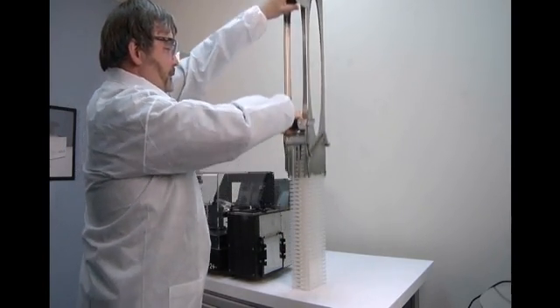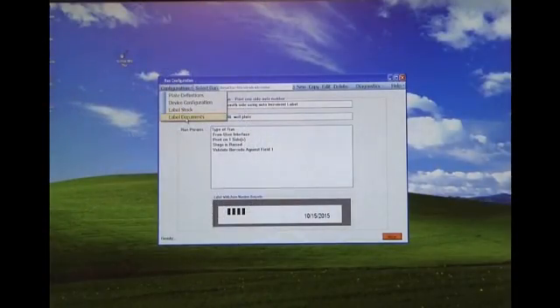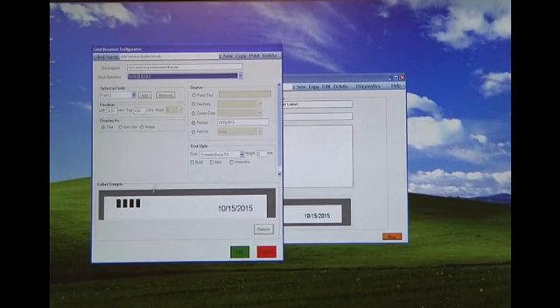By pressing the thumb tab, the plates can be released directly onto the bench top. The Windows-based control software allows the user to configure label text with multiple formats, which can be saved as individual run templates.